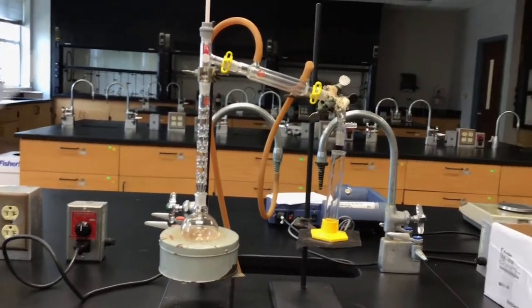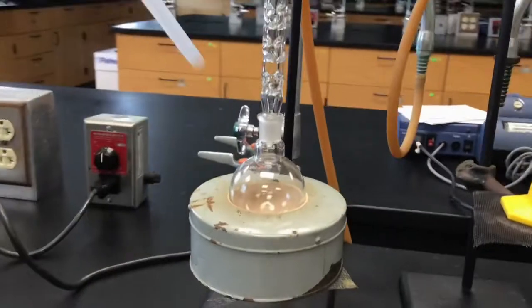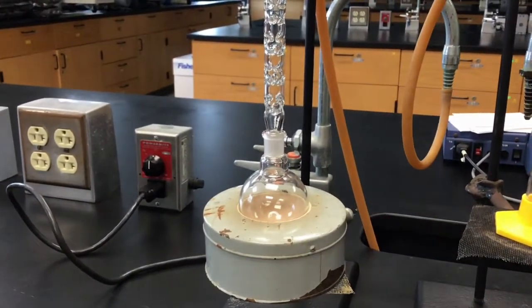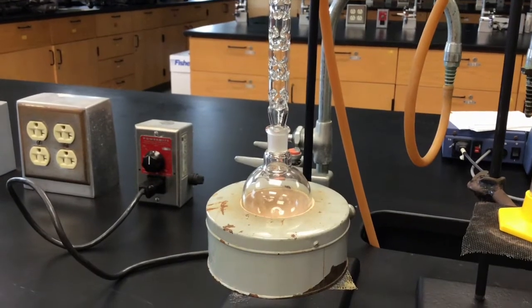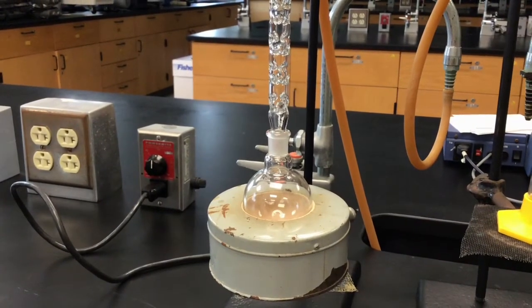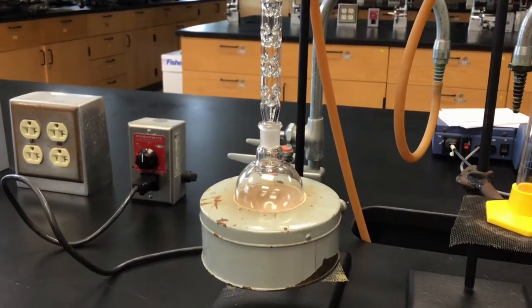Alright, over here, this is your heating mantle which is connected. Normally you'll have a little bit of sand in the bottom to have good contact between the heating mantle and the pot itself and so the sand will be shown to you when you get into lab the day of the lab. You can ask the TAs if we forget to tell you, but I figure we're going to tell you because you need to do this.